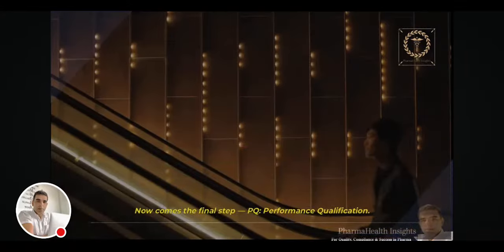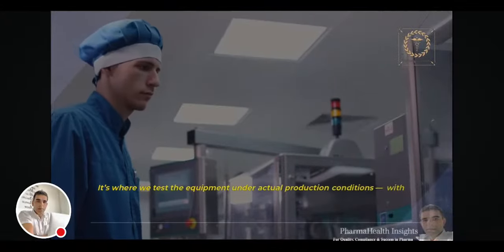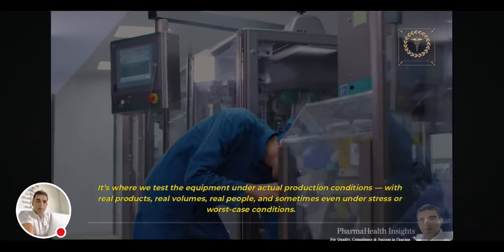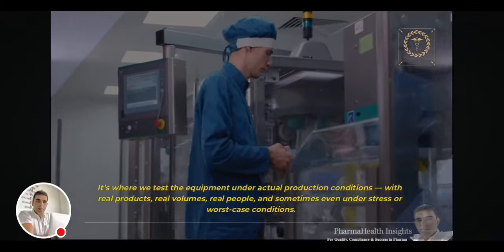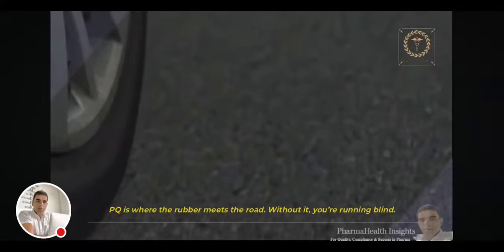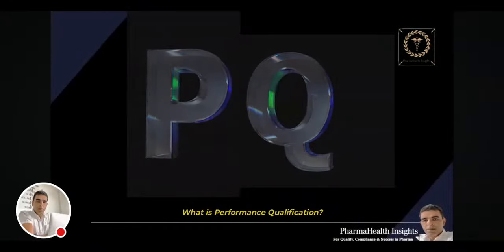Now comes the final step, PQ, Performance Qualification. It's where we test the equipment under actual production conditions, with real products, real volumes, real people, and sometimes even under stress or worst case conditions. PQ is where the rubber meets the road. Without it, you're running blind. What is performance qualification?